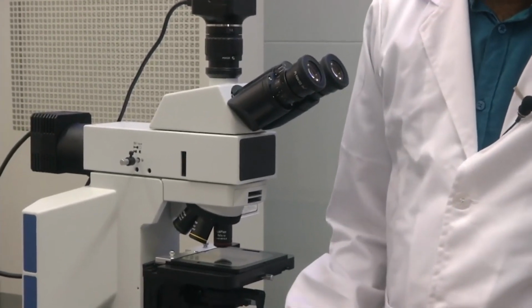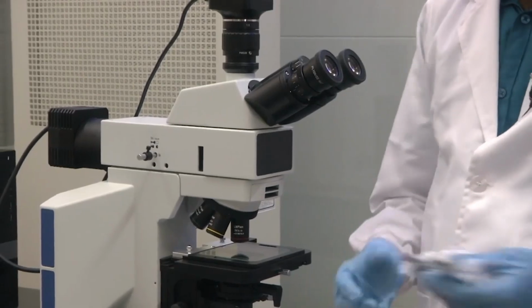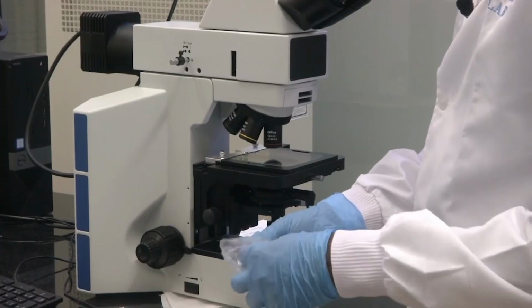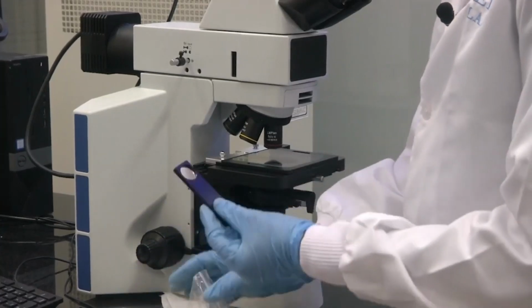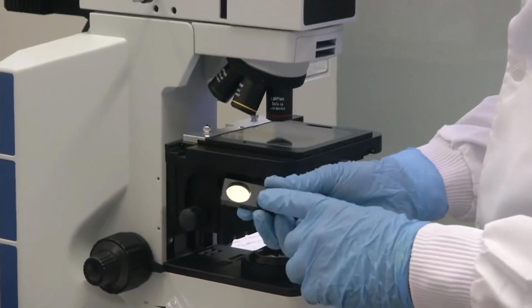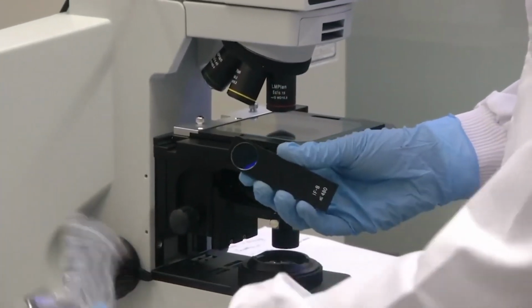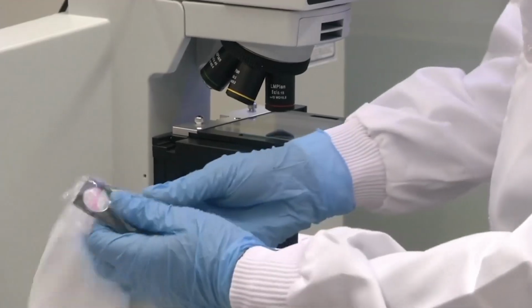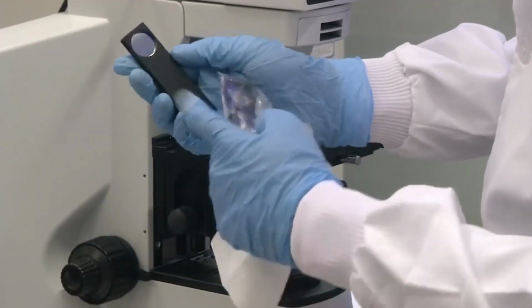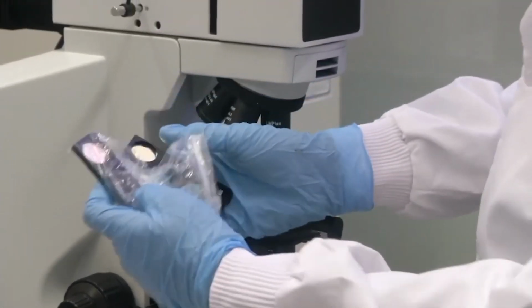So I will show you a few more filters which we are having. Because anyway we went to the filters, we thought we will show you. So let us see, this is a yellow color filter. I don't know, through the camera it might come as a different color, but this is a yellow filter. Likewise we have a green filter, blue filter. So this is blue filter, this is green filter.